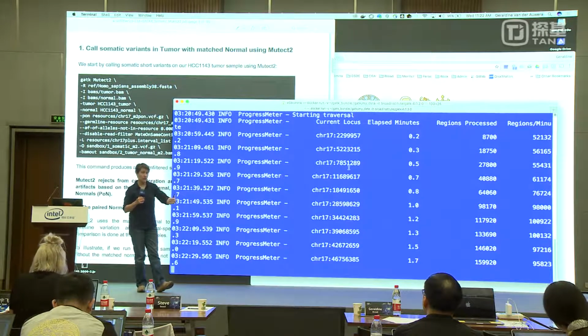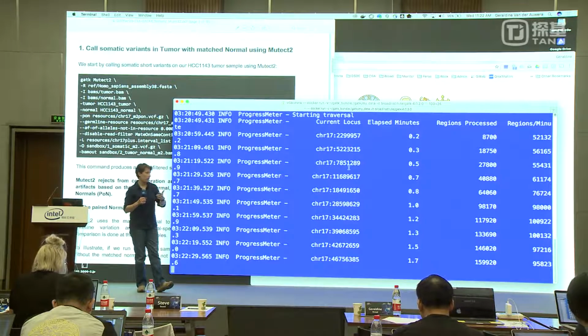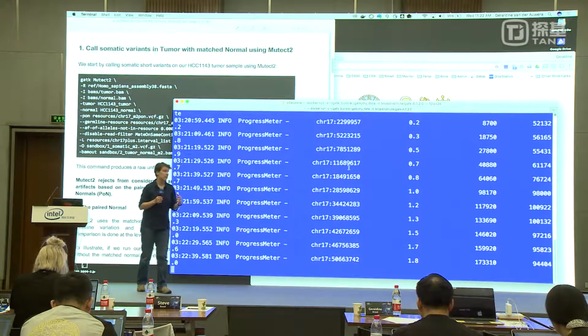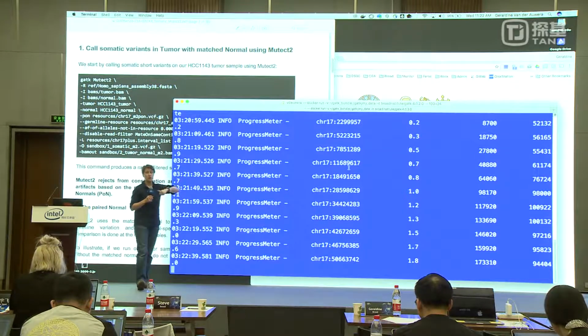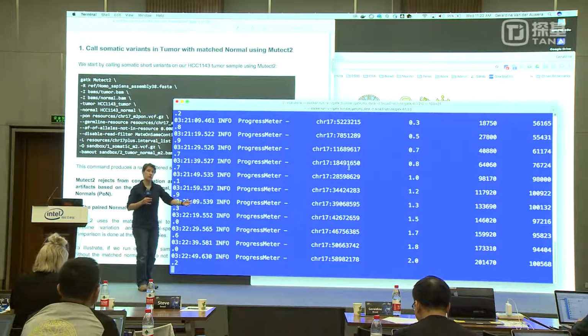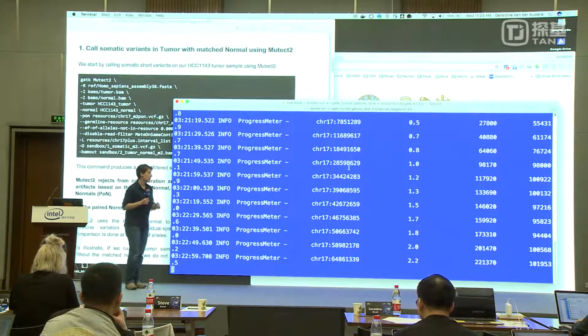Now, to compensate for that, I believe there's some logic that has been built in more recently into the tool, so that we can actually dismiss things that are obviously germline. So there's a lookup to the resource and to the panel of normals that allows you to not have to do it if you already know that this is going to be a germline variant, because you don't want to do work on that. So that's an optimization that can be disabled, but it is an optimization.